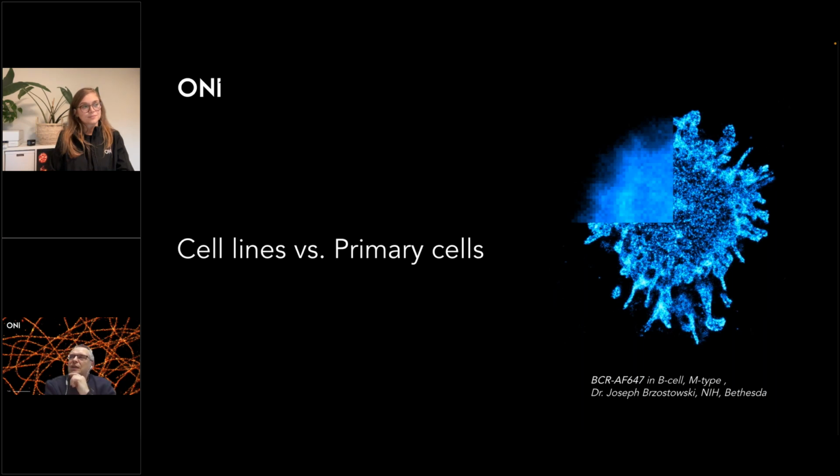Also, be careful that if you're using collagen, the material has a different density. In this case, the light penetration is different, and the backscattered light is different. So when you're collecting the signal, you might get a lower signal to noise ratio. You will basically be collecting a lot of noise, so you will need to be able to filter it out.